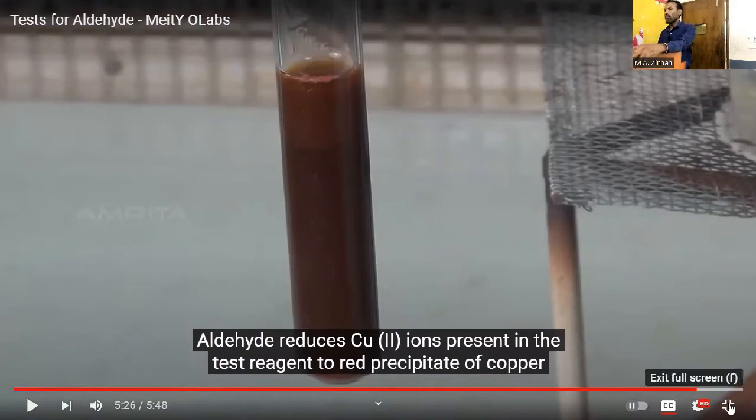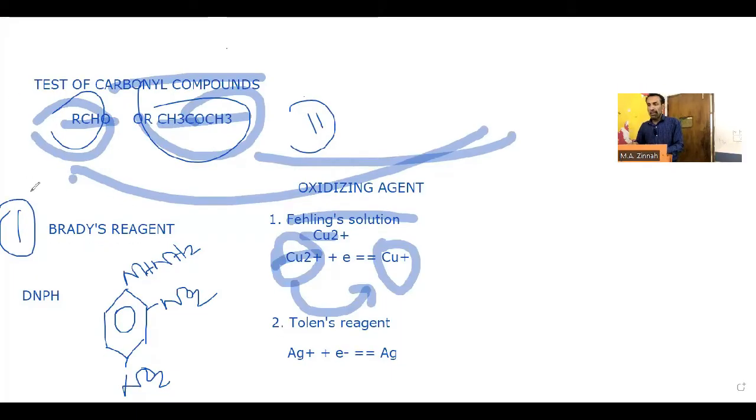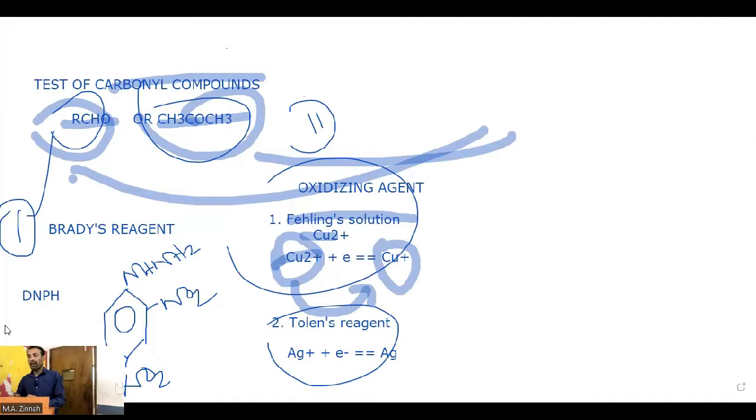Both the tests, with silver ion and copper ion, are positive for aldehydes only. Ketones don't give these tests. So this is how we can distinguish them. These were the topics of the last class. First was the first test, then the distinguishing test. Another problem we will talk about today: if we can identify that the compound is a carbonyl compound and it is an aldehyde, then which aldehyde is that?